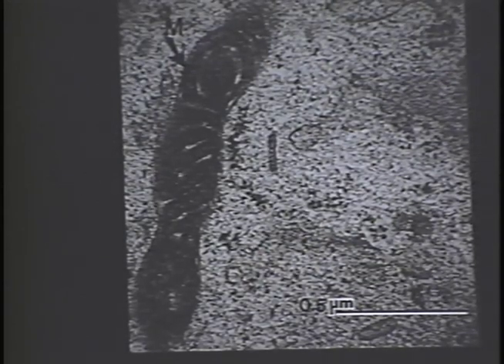At higher magnification, there is little evidence of ice crystal damage, which would be visible as a reticular pattern in the cytoplasm. Here it's very dense and uniform, and there are no clear halos around organelles, as there would be if there was ice crystal damage.